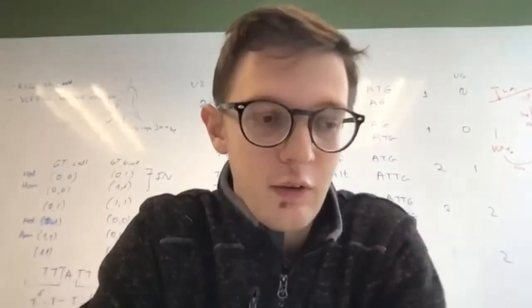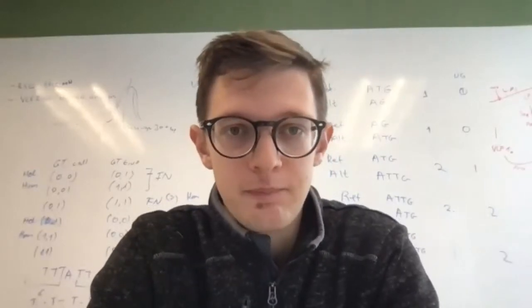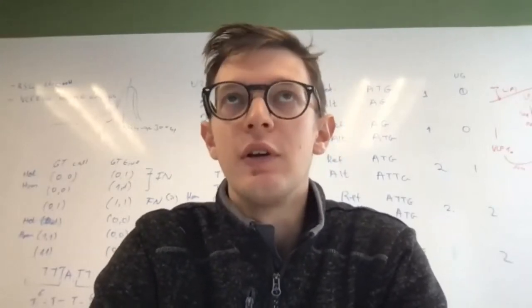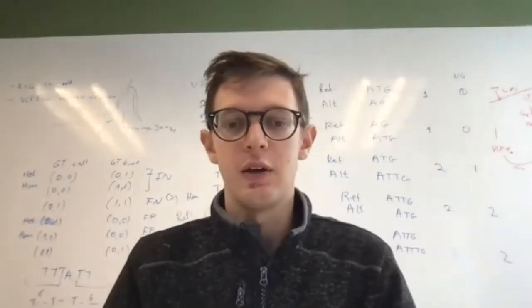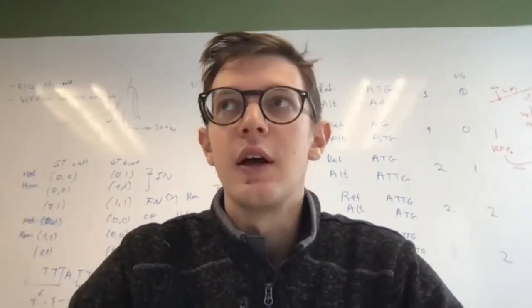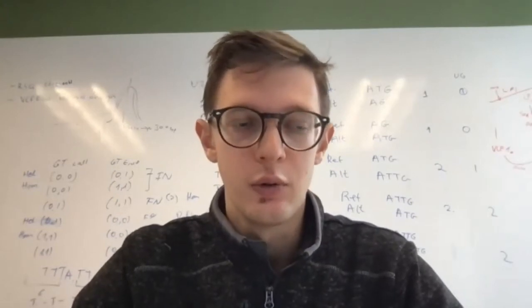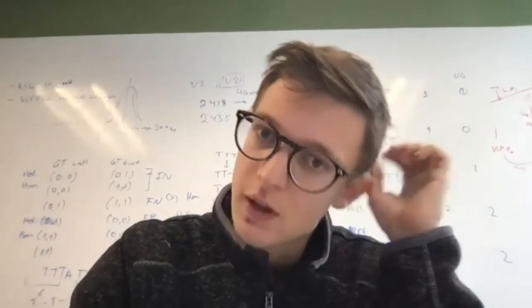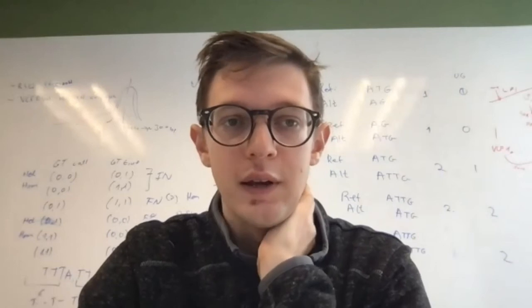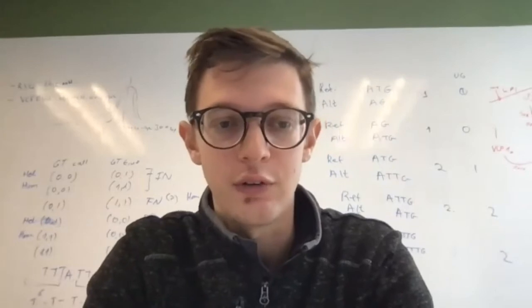I think so, we have not been running functional equivalence evaluations for exome. We have only looked at whole genome at this point. However, we expect the results to be very similar, obviously. But at this point, we cannot guarantee that you will be able to combine exome data run with DRAGEN and exome data run with DRAGEN-GATK without any batch effects, even if using the functional equivalent configurations.